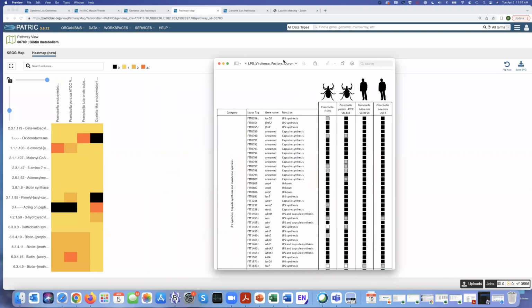But this is pretty good though, right? It's amazing, yes, it's pretty awesome. Now go ahead, question. Omar, there are other tools when you do the protein family analysis. It gives you more control over exactly what protein families or EC numbers you want to include. Oh, I'm about to show that too. Not so much EC, but I'm showing you this.